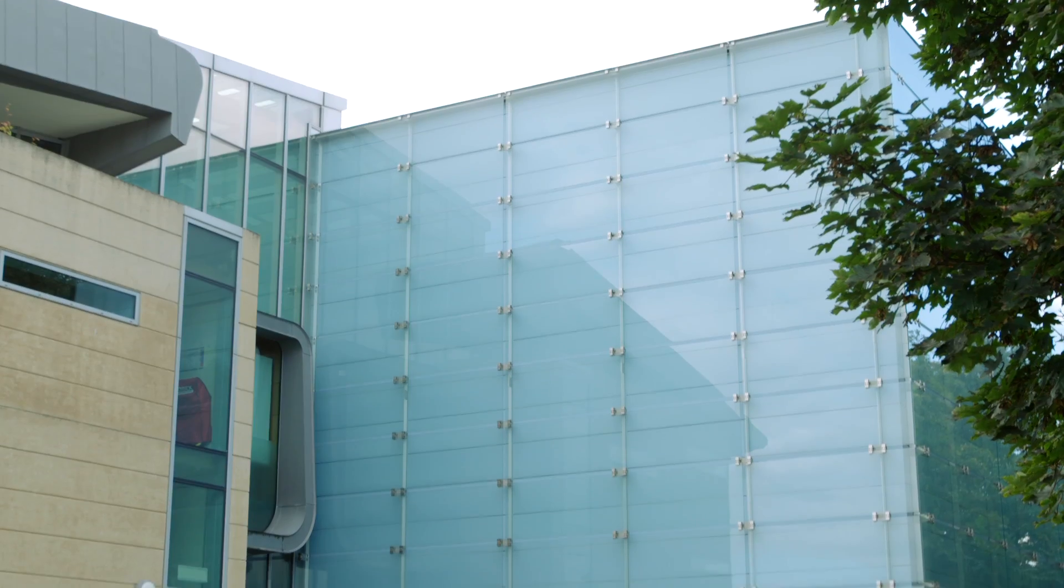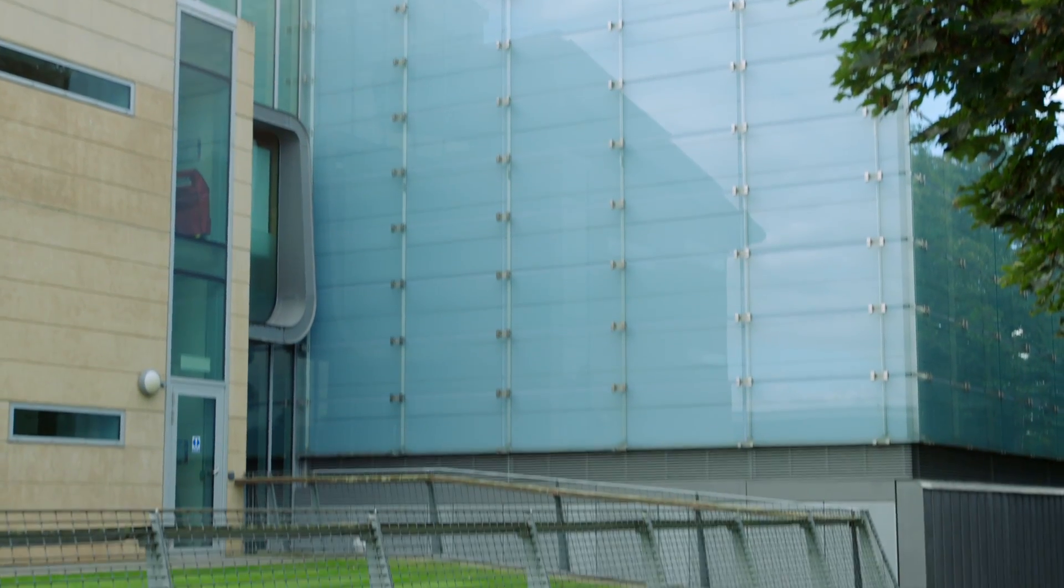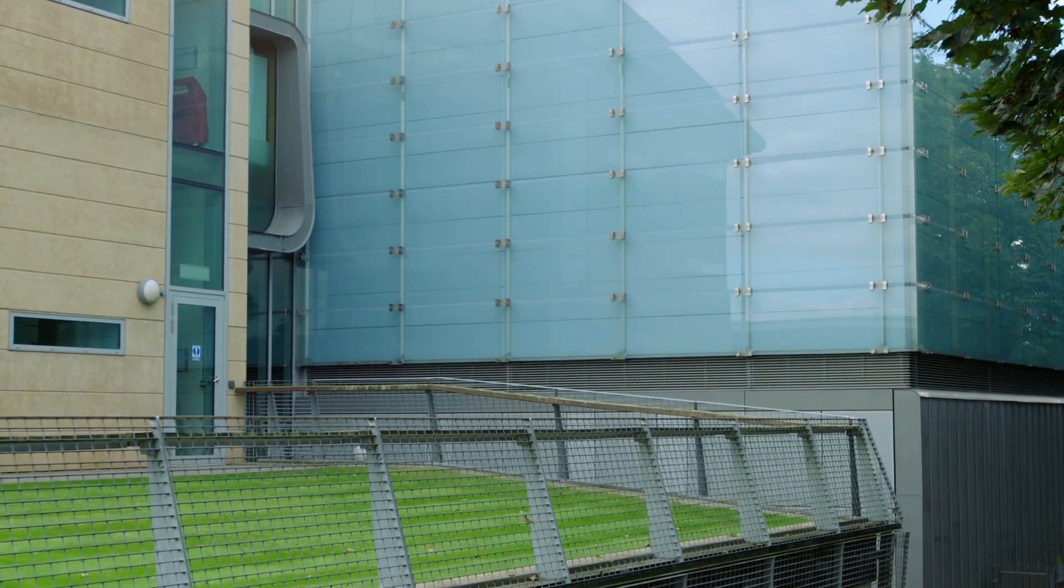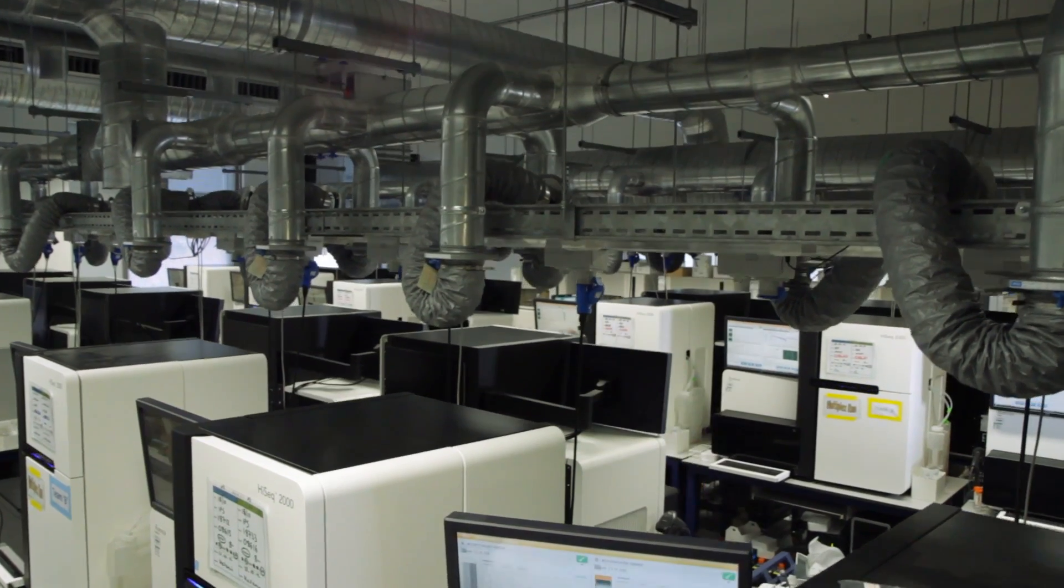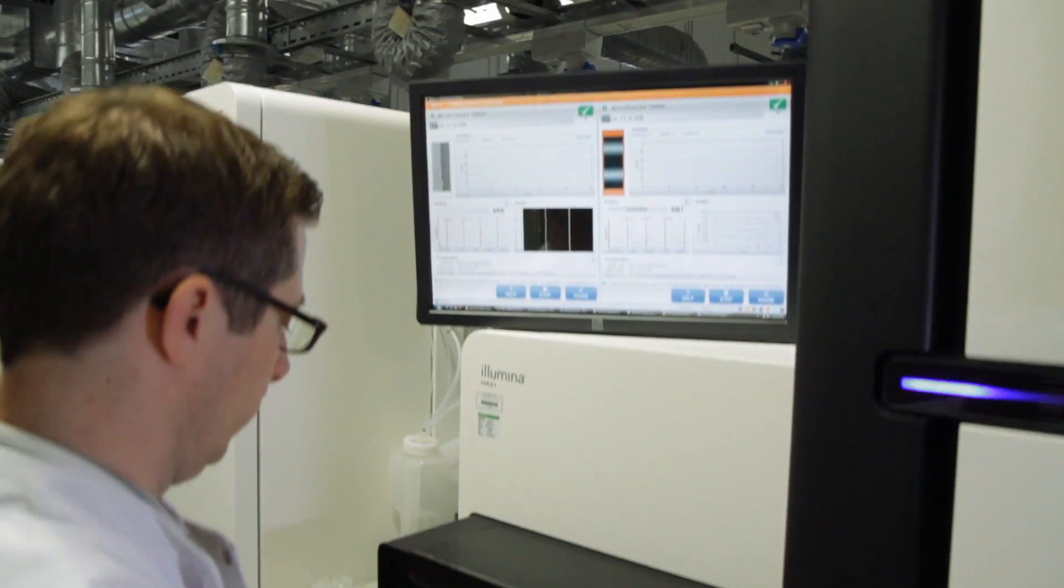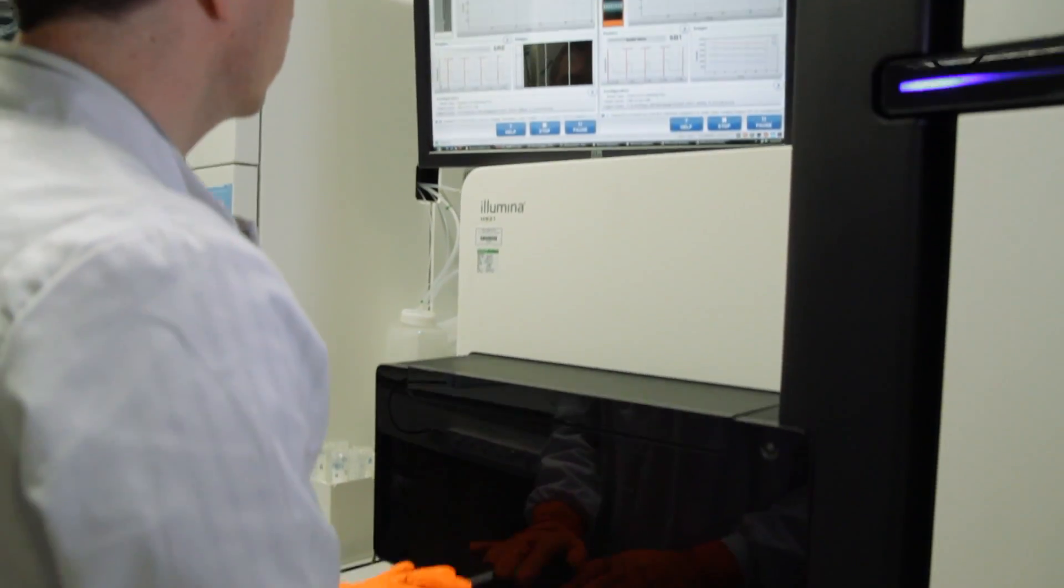The Sanger Institute's sequencing facility now produces more data every hour than we did in our entire first 10 years of operation.